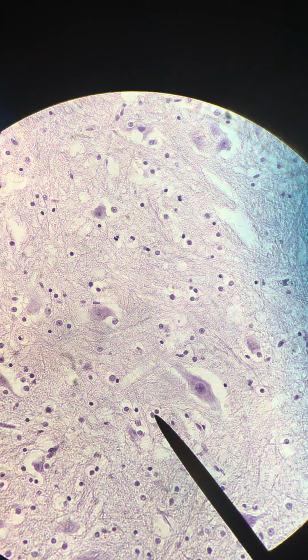All right, so that is what we would like you to know for the spinal cord. We'd like you to be able to look at a neuron, recognize how it looks different from neuroglia, as well as identify the gray matter, which is in the center of the spinal cord, and the white matter, which is on the outside. Okay, so that's it for this one.